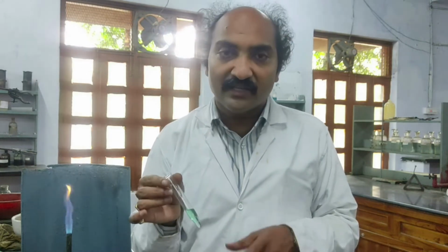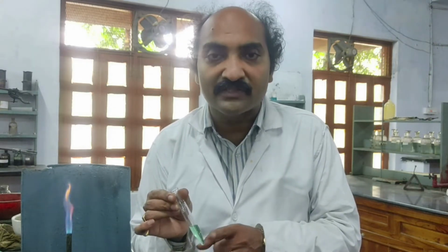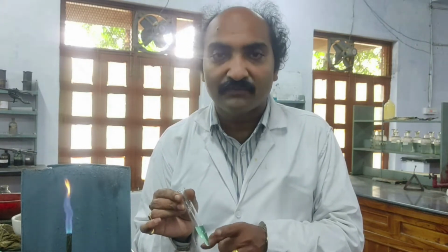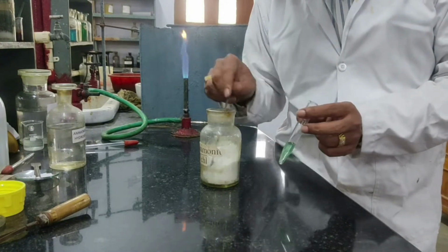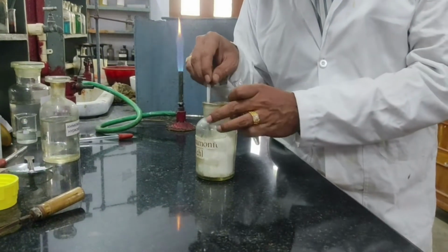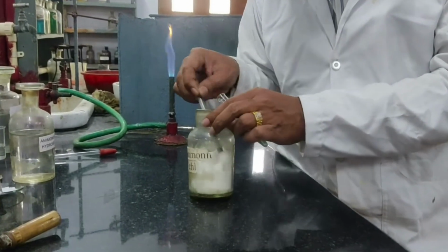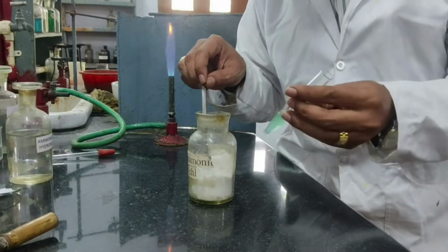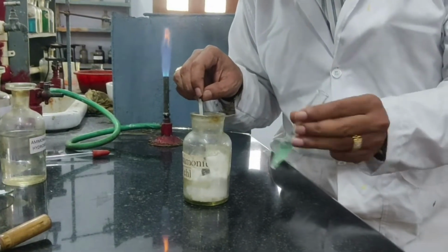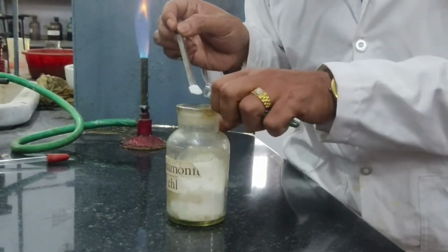Okay, so let us see whether we get a precipitate by adding fourth group reagent to this solution that is supplied to me by the lab attendant for fourth group analysis. To this solution, I am adding ammonium chloride in excess because I need to prepare a saturated solution. So I am adding ammonium chloride. I am checking whether a saturated solution is obtained or not. I did not get a saturated solution, therefore I need to add some more ammonium chloride. I am adding.